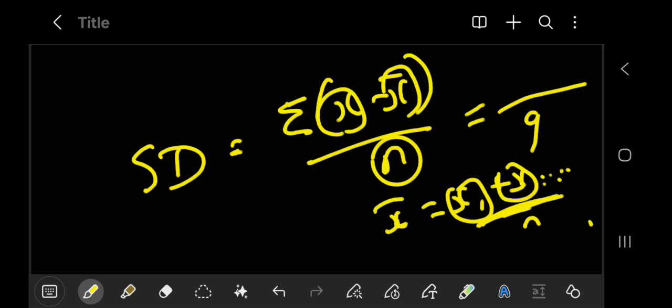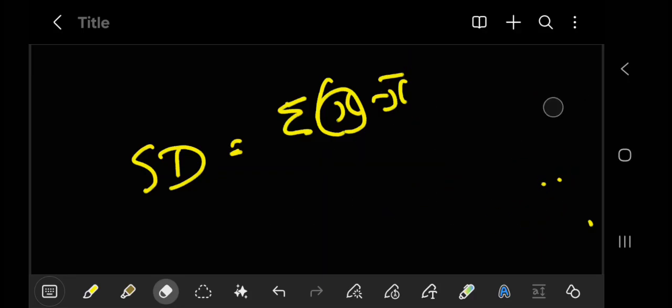So in a nutshell, in this experiment you should know the theoretical aspect very well, and how to plot the graph, just like I've explained in the previous experiment 1 on dissociation constants. So that is just an overview of that experiment.